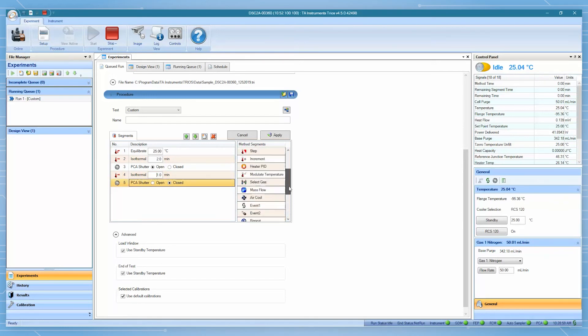Perform isothermal for 3 minutes to get a stable baseline. It may be necessary to increase this isothermal time if the curing peak has not yet reached baseline. You can also do a multi-exposure experiment by adding a repeat segment defining a number of exposures.